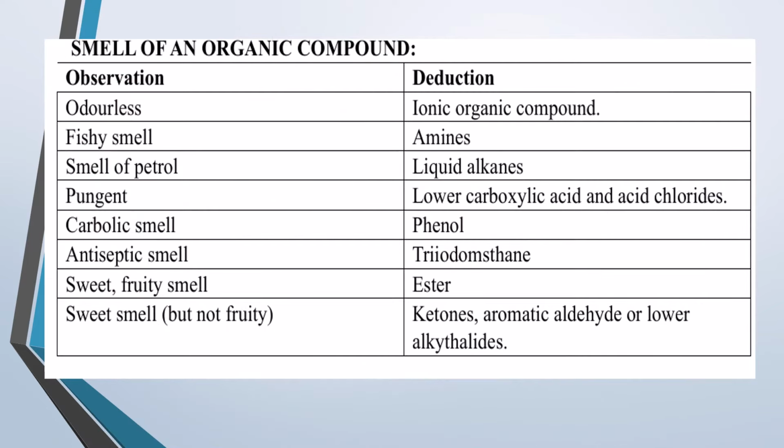Now for this, I made a summary just because some of you may require it, or some of you are good at identifying compounds before doing the experiment. Sometimes you may get a compound, or they may give you a substance, mainly those in liquid state, and you first smell the compound and then anticipate the class in which it falls.